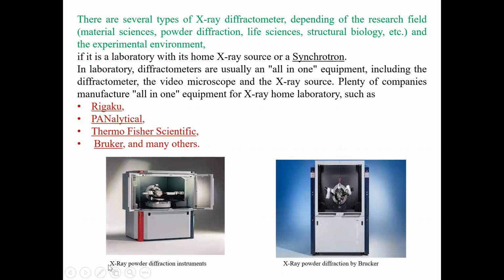So here I am showing only the X-ray powder diffraction method, which is always used in the chemical sciences or the physical sciences, and this one is the X-ray powder diffractometer. So this company is different, but this X-ray diffractometer is a powder diffractometer. So it gives the same informations, but the company is different. So the quality of your picture or the quality of your parameters is different over here, right?